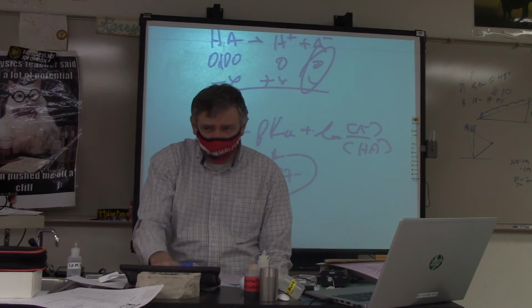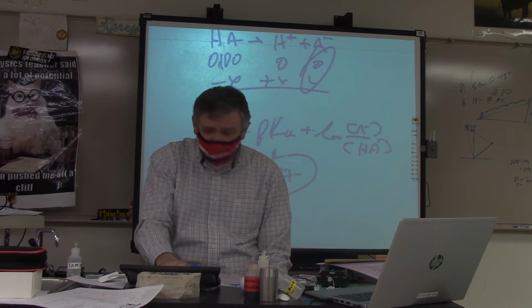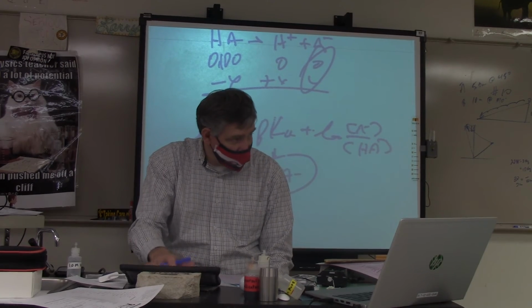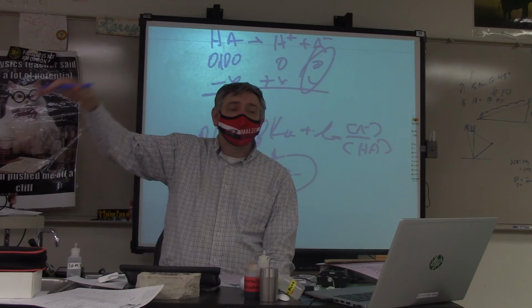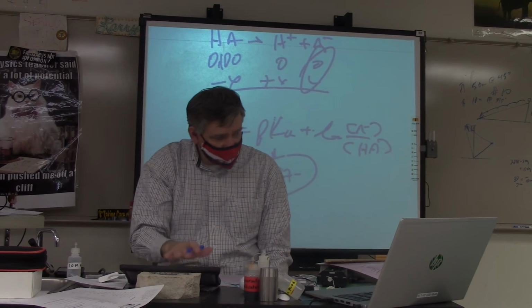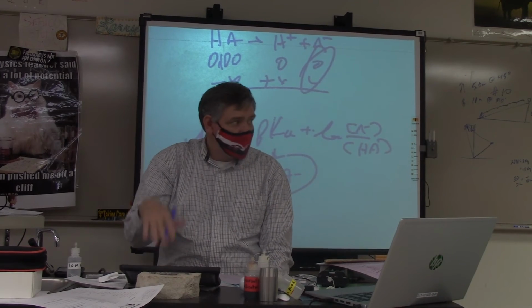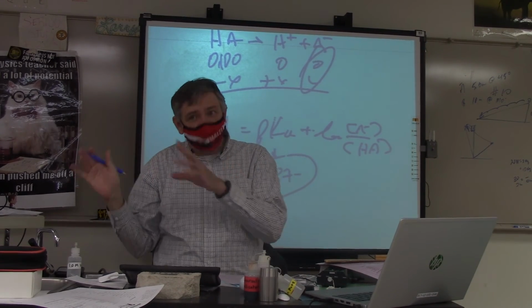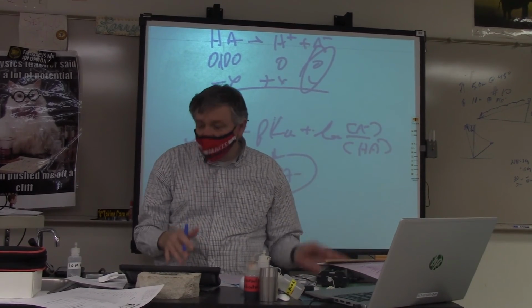So here's what you need to do, okay? Do that third titration, okay, do the mass calculations, do that third titration, get that done, okay, because I got to share that with the people from yesterday. And then do those mass calculations for the ammonium chloride and the sodium acetate and run those. Then after that, that's all you actually need to do in the lab. The rest of it becomes a series of calculations and questions to answer.